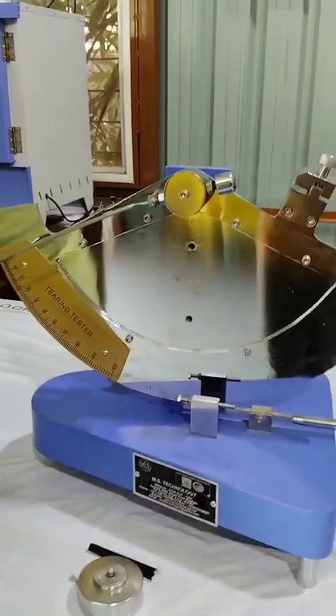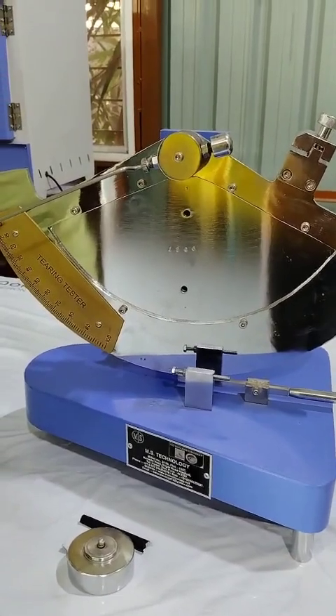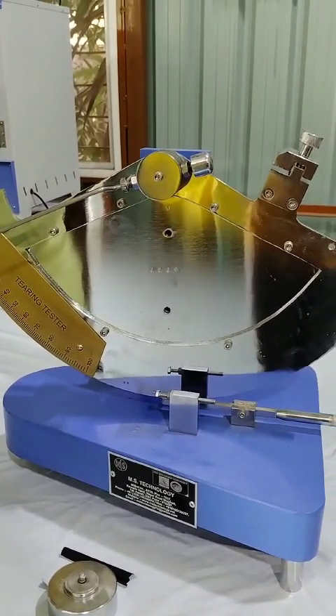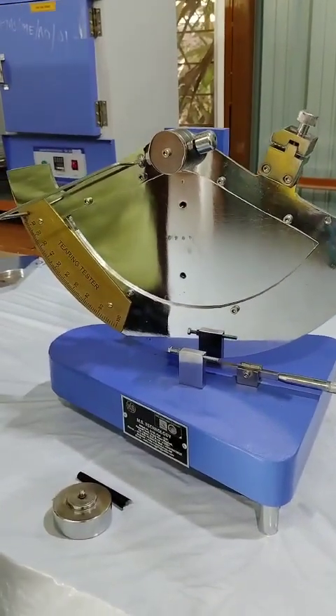Hello everyone, welcome to MS Technology. In this video we will see the working of a tear tester. So, let's see the working.